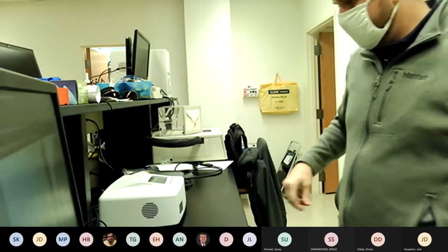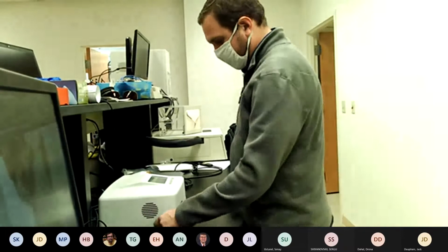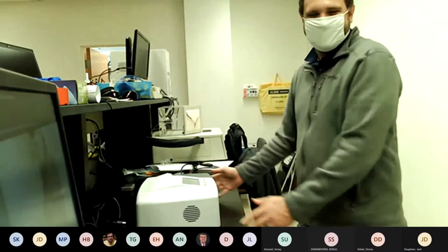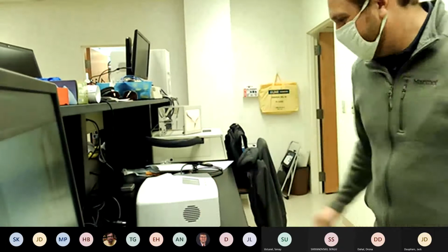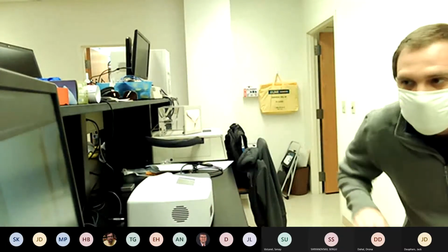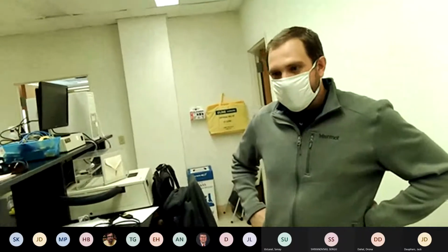Okay, so thank you for coming to today's demonstration on our new Raman spectrometer, and Eric will introduce the whole machine and how to use it. Okay, so now it's your turn.